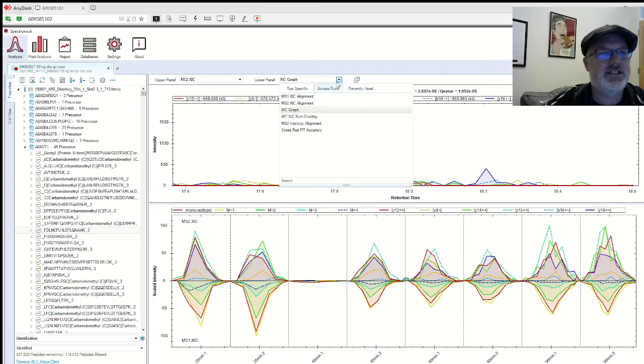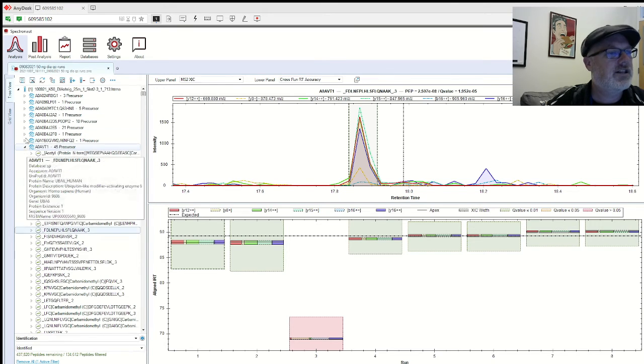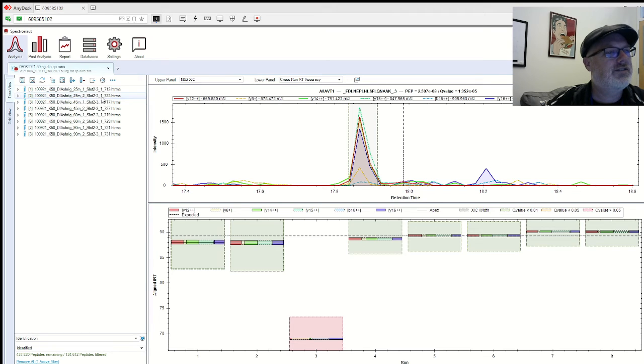Yeah, this is just amazing. So why this is amazing is that what we're looking at here, and this is one of my favorite plots, is how this is sampled across different runs. So we have, how many runs do we have again? We have 2 at 25, 2 at 45, 2 at 60, and 2 at 90.